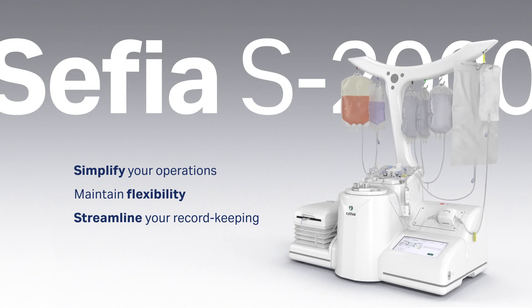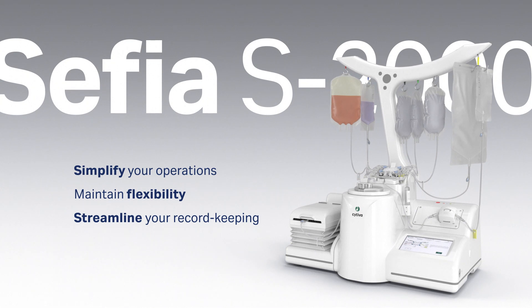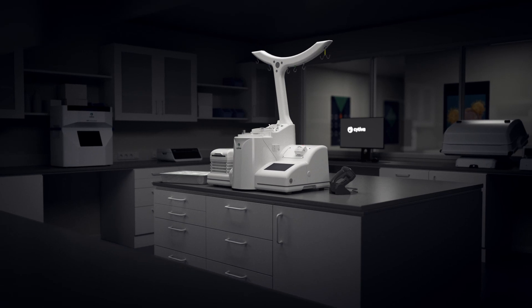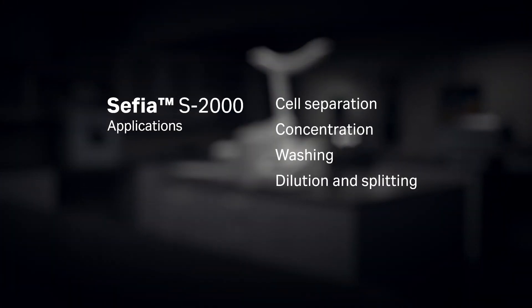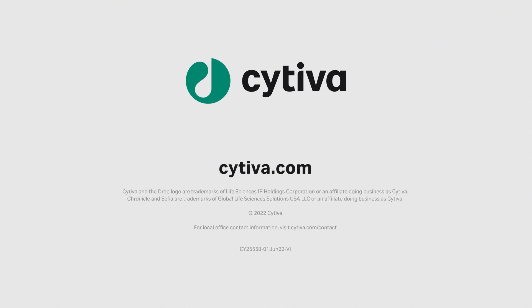The Sephia cell processing system can help you simplify your operations, maintain flexibility, and streamline your record keeping. It's your multi-purpose solution for applications including cell separation, concentration, washing, dilution, and splitting. Contact Cytiva for a Sephia instrument demo.